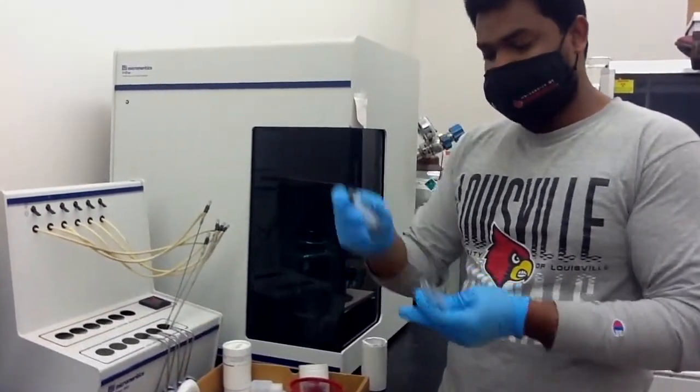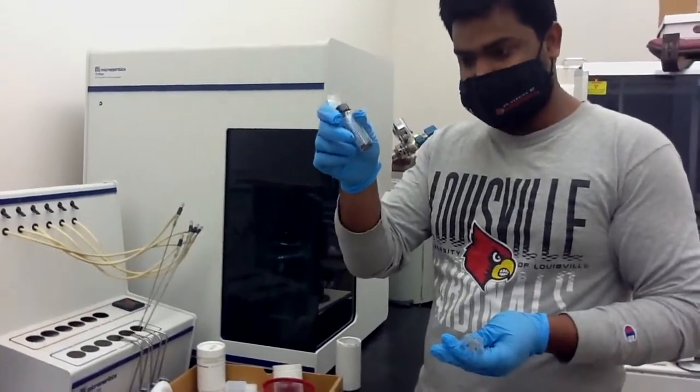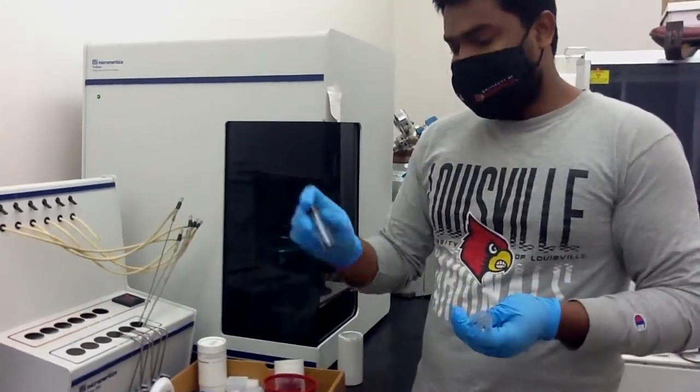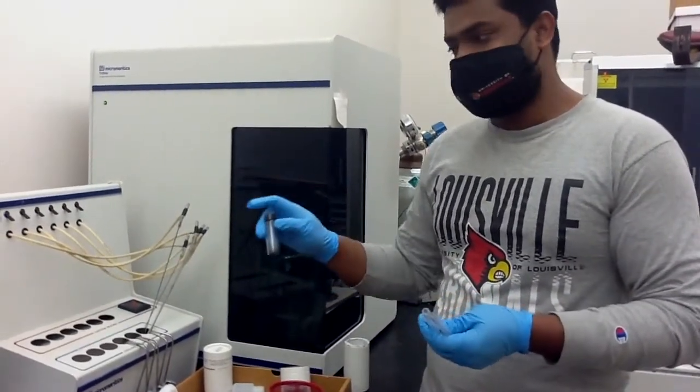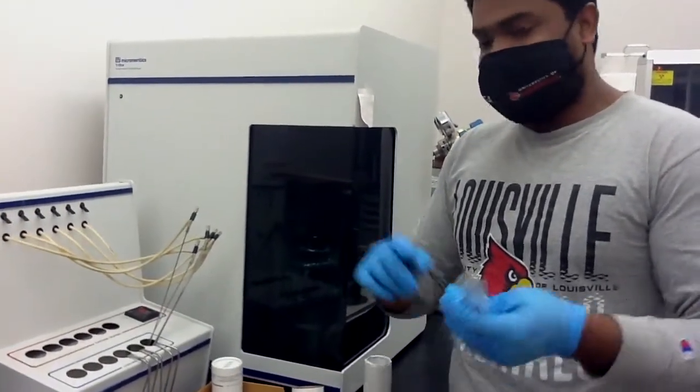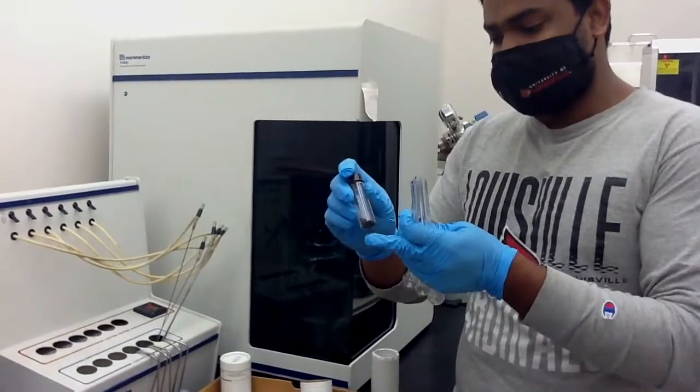Today I am going to show you how to measure the surface area and pore volume and pore radius of the porous material. To begin the sample analysis, at first we need to dry it. That means we need to remove any moisture and any gas from inside the pores of this sample.